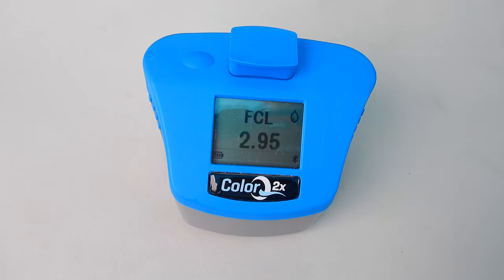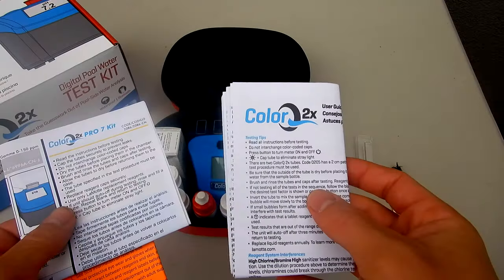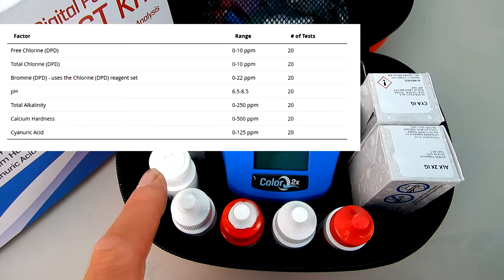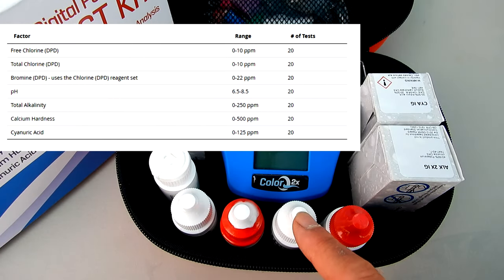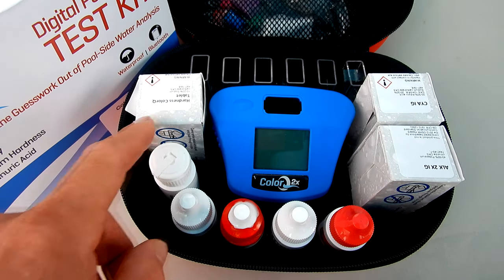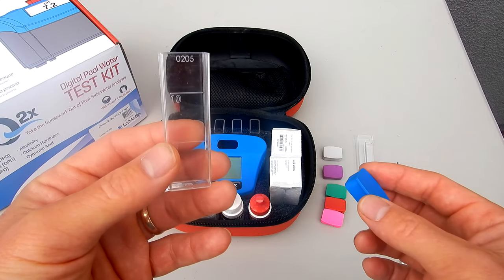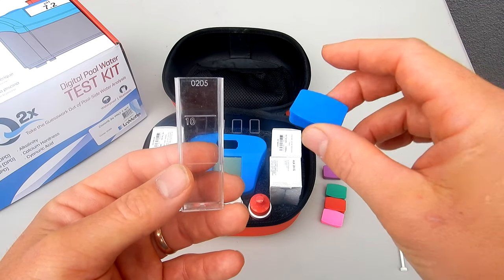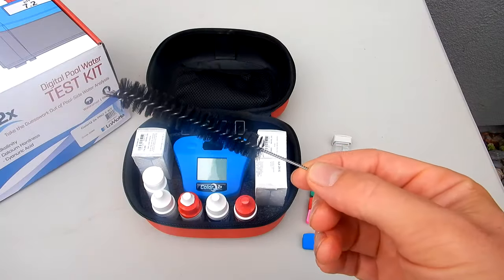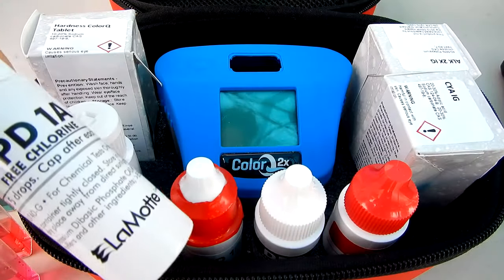One of the first things you're going to notice about the ColorQ 2X is how fast it does the water testing. Included in the box is the user guide, the testing instructions, and the safety data sheet. The 2X will test for free chlorine, combined chlorine, bromine, pH, alkalinity, calcium hardness, and cyanuric acid. The test tubes of the 2X have also been redesigned, with specific colored caps for each test factor. Also included is a brush to clean out the tubes between testing, and a crusher stir for the tablets.